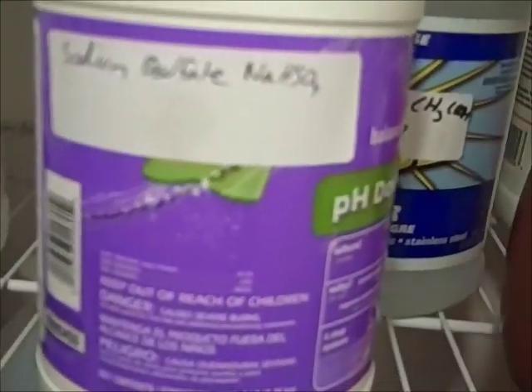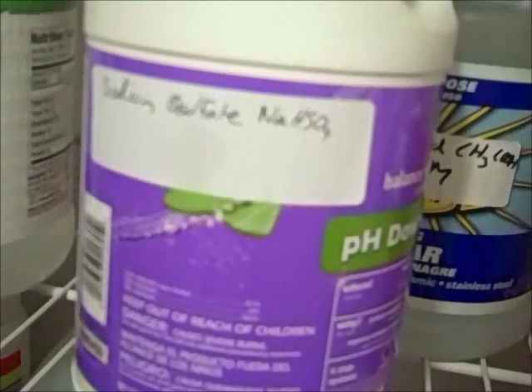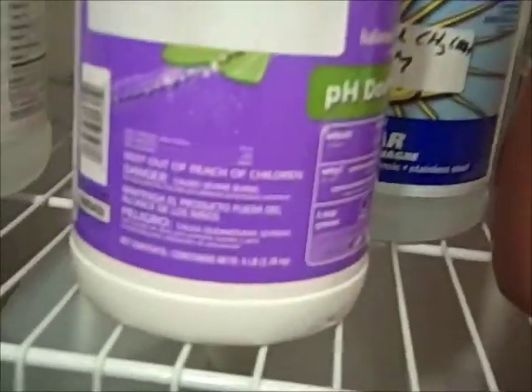Alright, next to be mentioned is sodium bisulfate. This is sold as a pool pH lowering chemical as an alternative to muriatic acid. It is relatively impure seeing as it contains sodium sulfate contamination. Don't know if you can read that, but it is very useful as a substitute for sulfuric acid. And you can get this at Walmart or any pool supplies company.